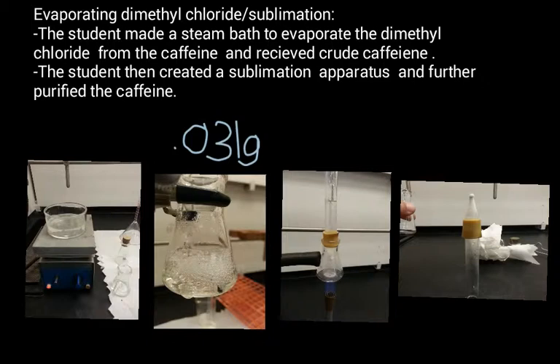The student then received about 0.0225 grams of caffeine after sublimation, which you can see right here on the right side. Pure white caffeine, 0.0225 grams.